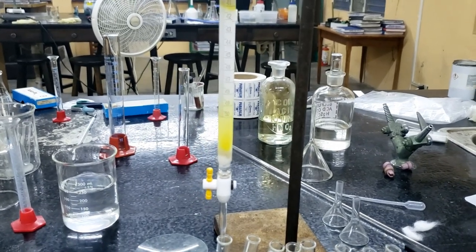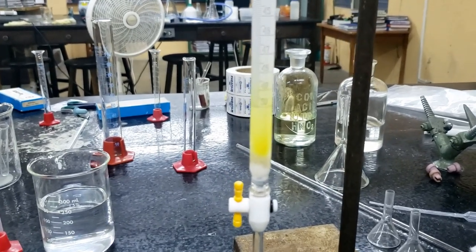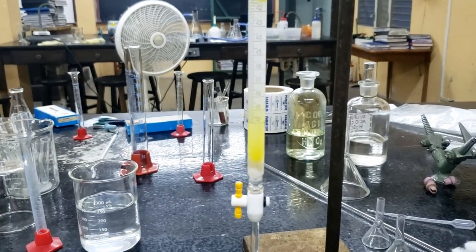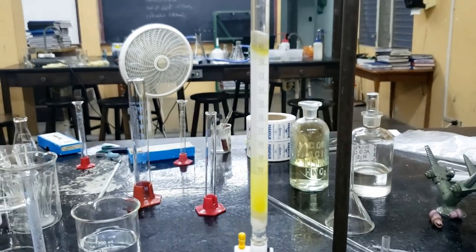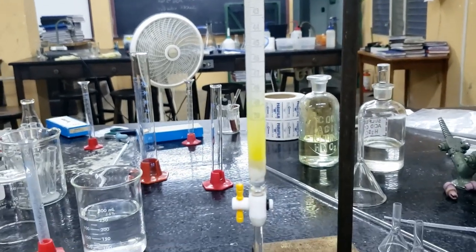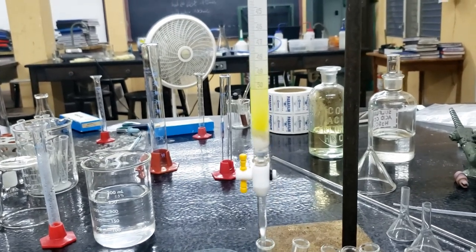We're now at about fraction 10. As you can see, the yellow part is almost ready to start coming through. So we should start to get some product soon in these following fractions. There's still a slight yellow band at the top, but the majority of the yellow part containing the o-bromonitrobenzene is all the way to the bottom.